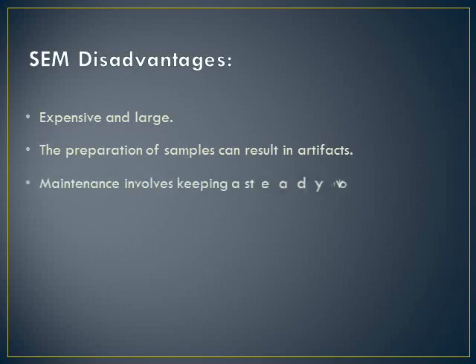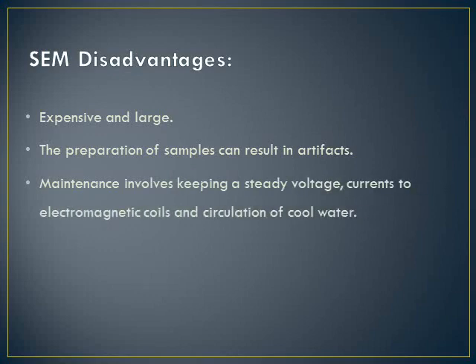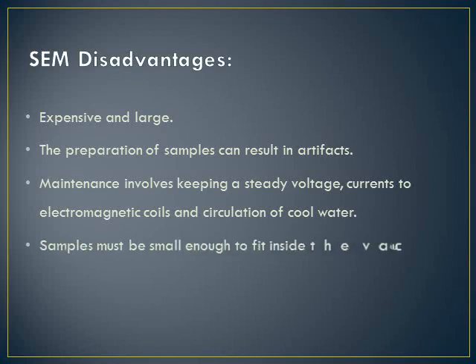In addition, SEMs are limited to solid, inorganic samples small enough to fit inside the vacuum chamber that can handle moderate vacuum pressure. Finally, SEMs carry small risk of radiation exposure associated with the electrons that scatter from beneath the sample surface.